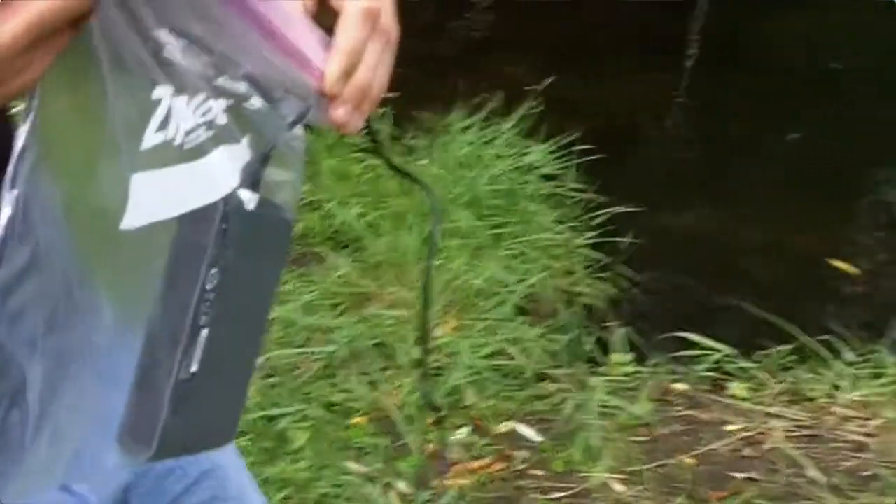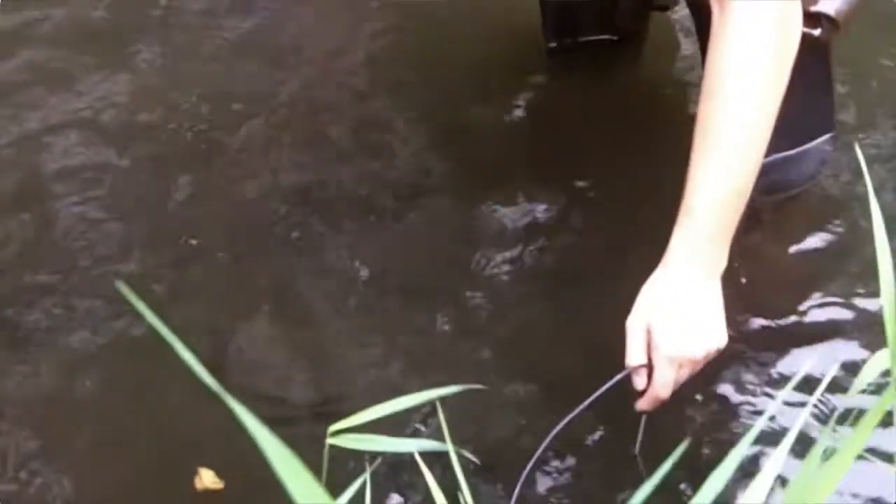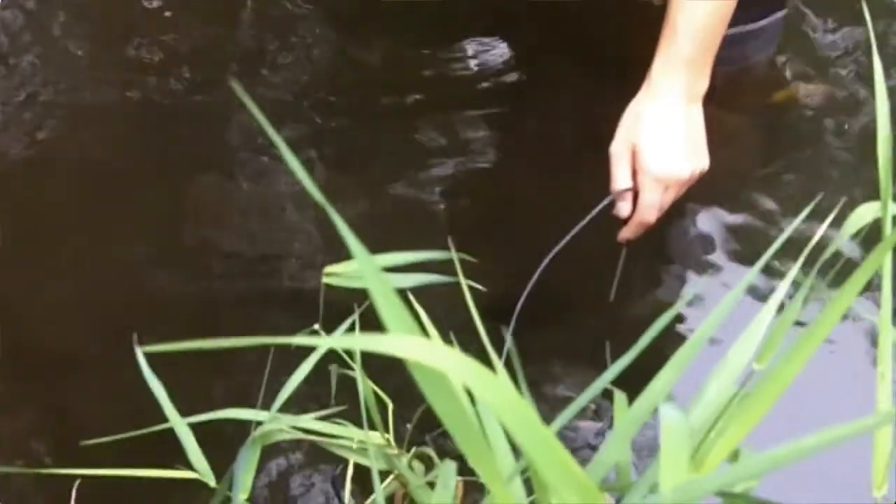Justin is going to measure the water temperature right at the very top of the water. It's reading about 18.2 degrees. We record that in our data table. Then Justin is going to put the probe a little bit closer towards the bottom — a little bit colder, 17.9 degrees Celsius. We record that on our data sheet, and then we're done with our temperature.